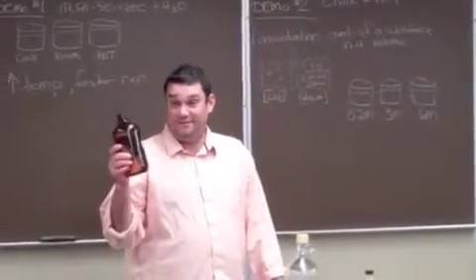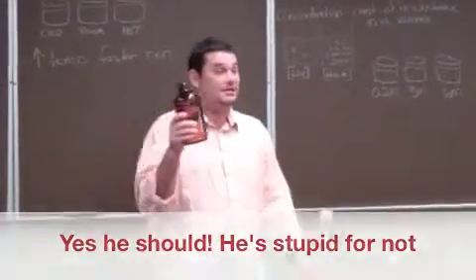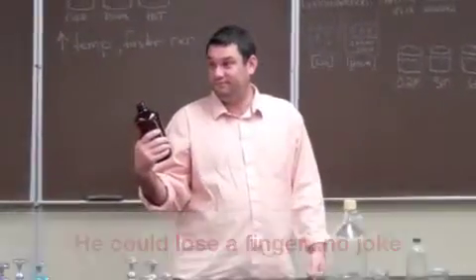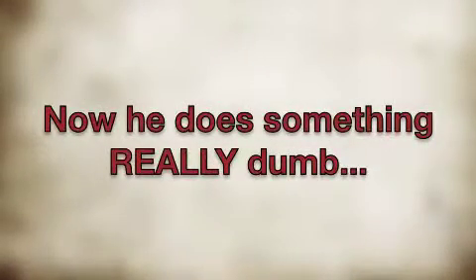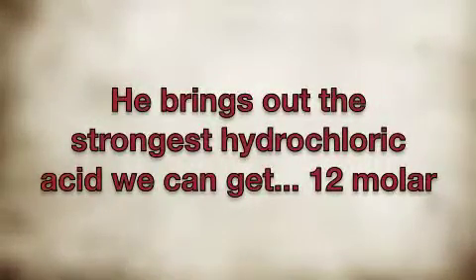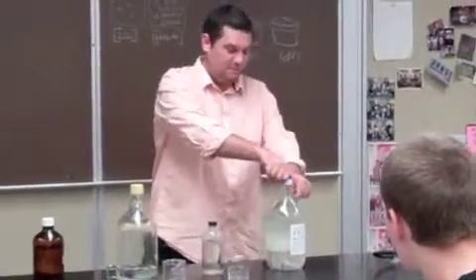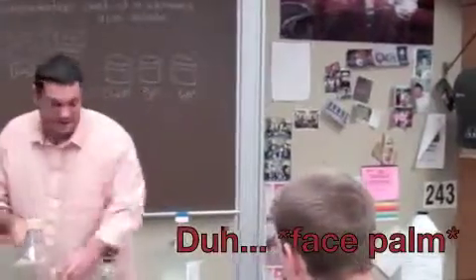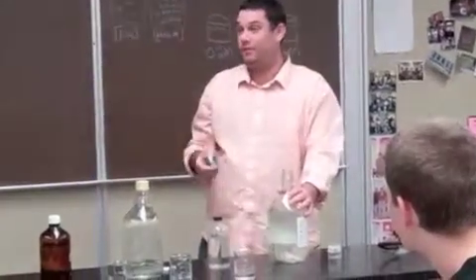And if you touch the stuff, I should really be using goggles and gloves, right? You should be, because if you spill this on yourself, you can actually burn your skin and disintegrate your clothes. It's 12 molar. And you can tell that it's strong because when I dump it into a beaker, I really should be doing this under the hood. I really need gloves for this, but I'm going to risk it. This would burn my finger almost off.